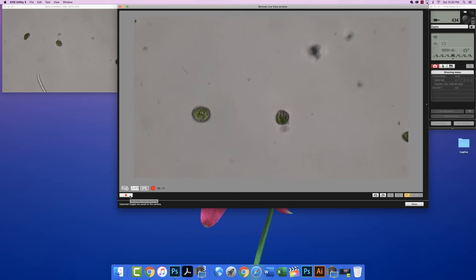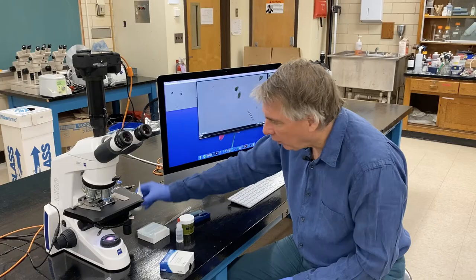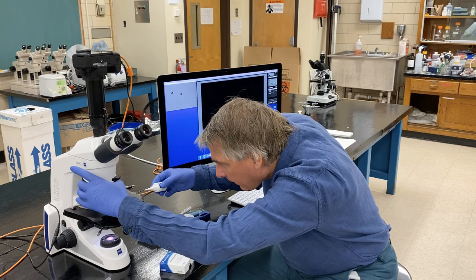You can see that they have a flagellum that they're using to move around. See a little whip-like tail. Okay, and then let's go up to 100x, so we need our oil. Just one drop. And swing the 100x in there.